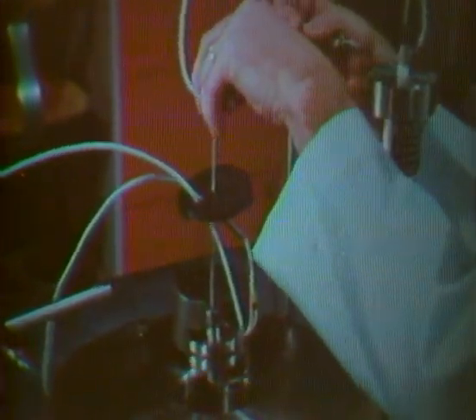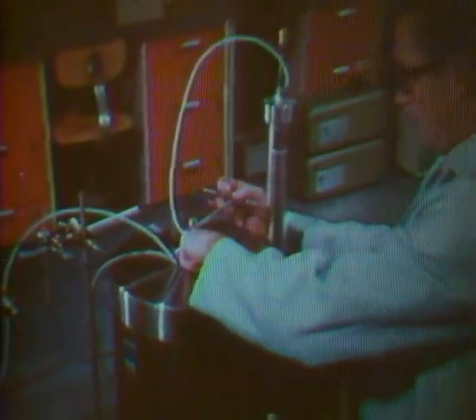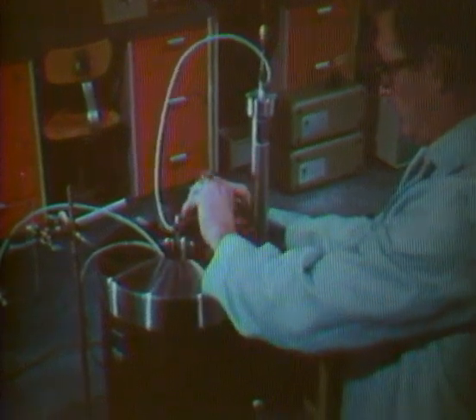For substances that have high molecular weight or are temperature sensitive, some other forms of chromatography are recommended. In these, the moving phase is not a gas, but a liquid. These techniques will be discussed in the second part of this film.